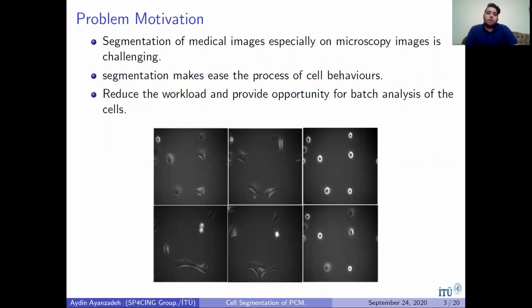So if we have an auto segmentation system, the biologist will have the chance to do batch analysis of the cells. So segmentation can be helpful for the biologist.